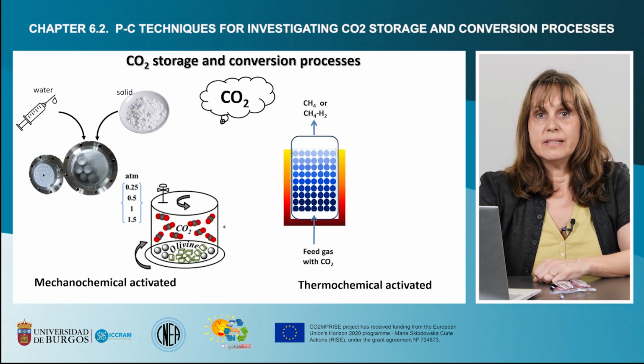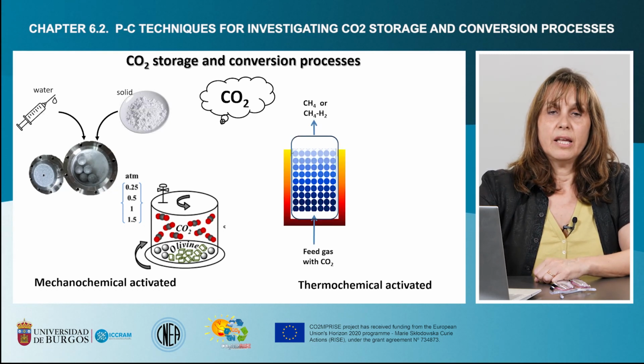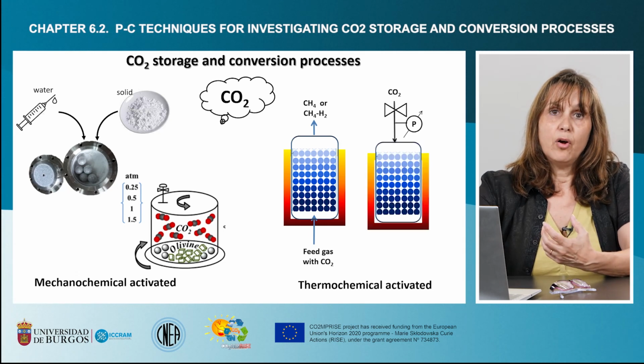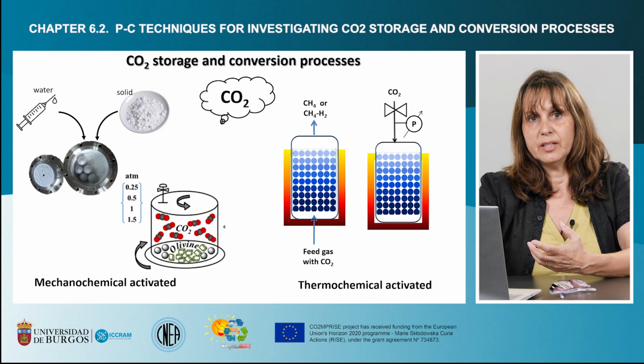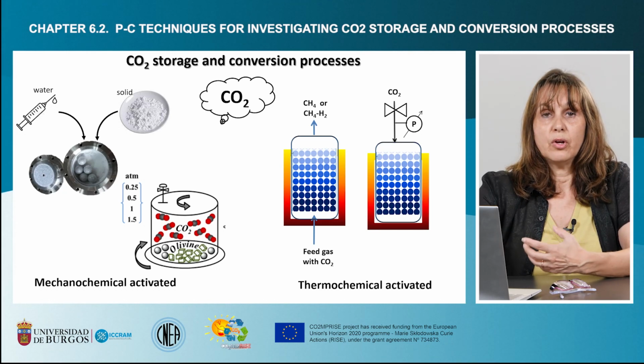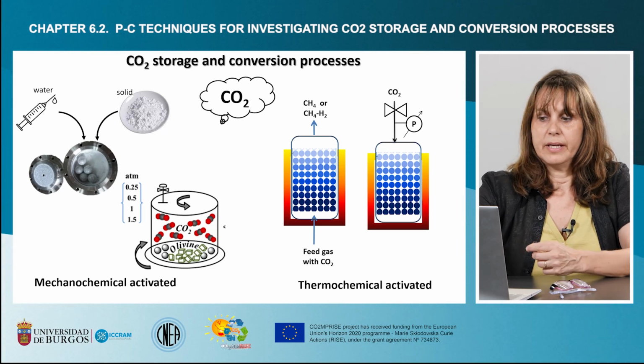The other option is the thermally activated reaction, in which the solid is inside the reactor in a flow system or in a batch system, using a temperature and also pressure of carbon dioxide.